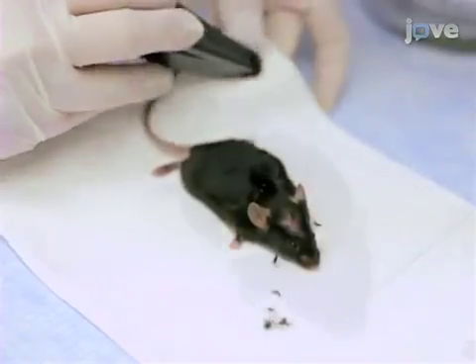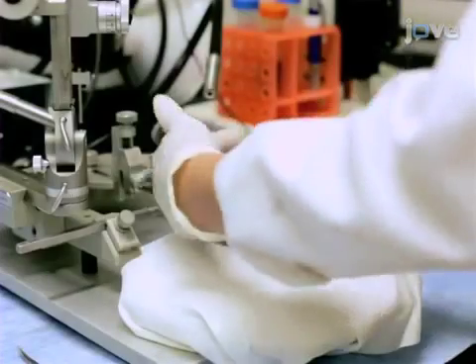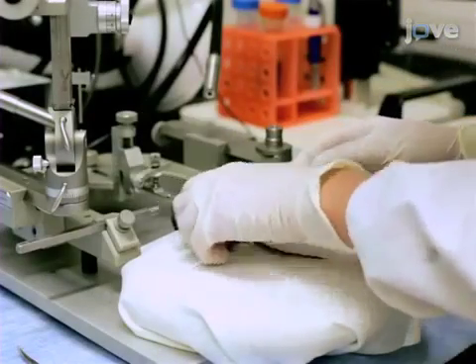Shave the head between the ears and eyes, and use sterile cotton applicators to clean the area with alternating washes of ethanol and iodine. Then transfer the mouse to the heated pad on the stereotax.